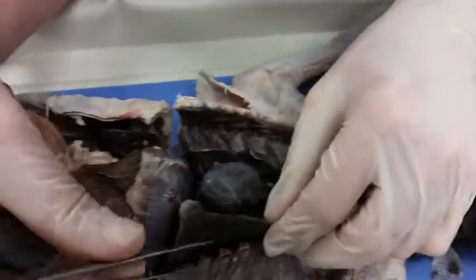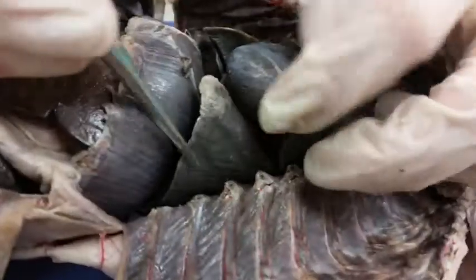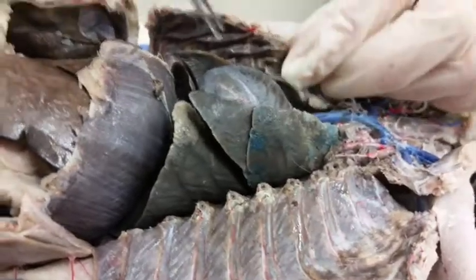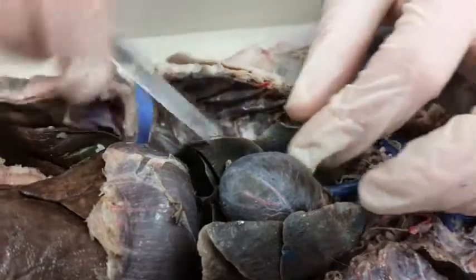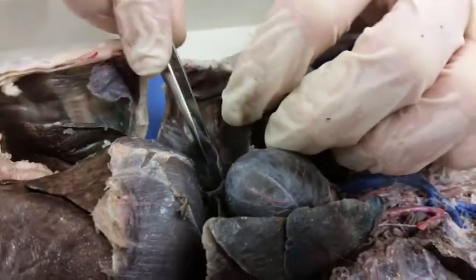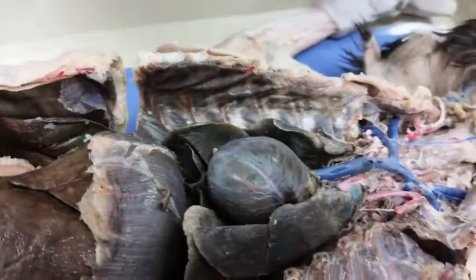The heart is pretty obvious. As for the lobes of the lung, we have the left anterior, left medial, and then we have the large left posterior. And then over on the right, we have the right anterior, we have the right medial, and then we have the right posterior. We don't have to worry about 2 lobes or 3 lobes because unlike in humans, the heart mostly hangs down, and so the lungs both developed into 3 lobes.